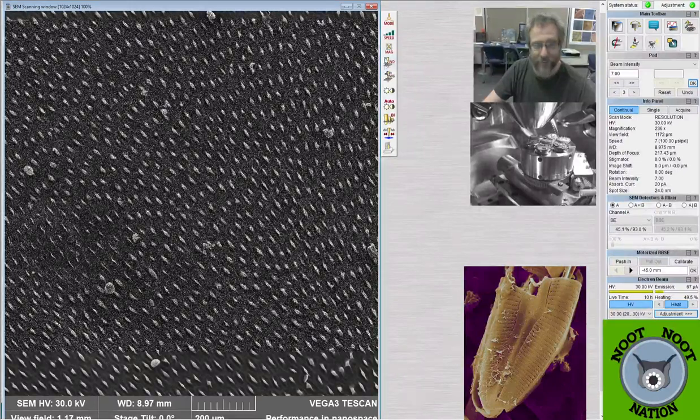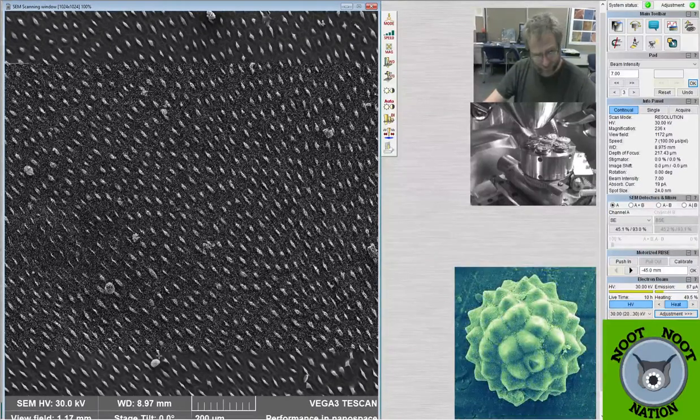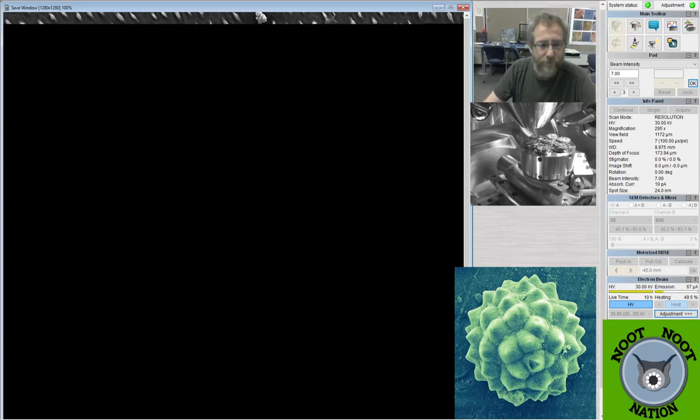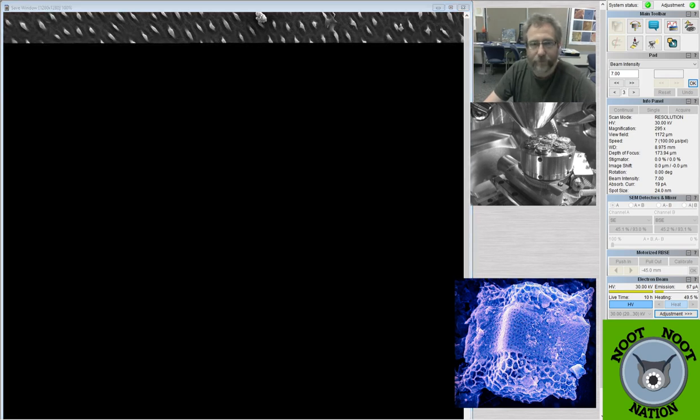It looks very reticulated. And I cheated a little before the stream started to see if there was pollen on every one of the stubs. So for the first 10 minutes or so while it was warming up, I was in here screwing around looking at the pollen. And I think that's the Flox pollen right there. So, I'm going to take that picture because, again, I like those really cool textures, especially when they're nested in these sort of fractal cell shapes. Okay, let's see, back to there.